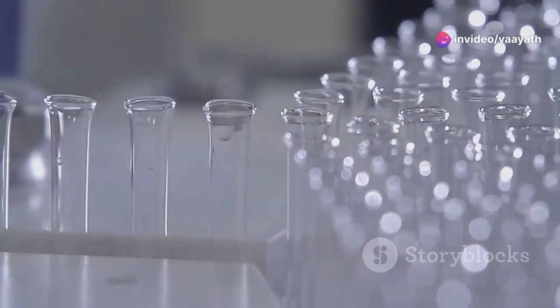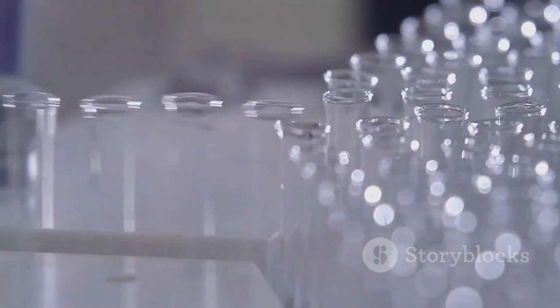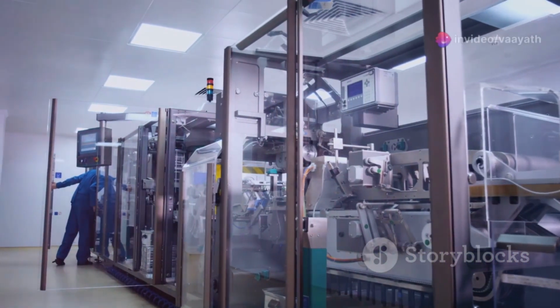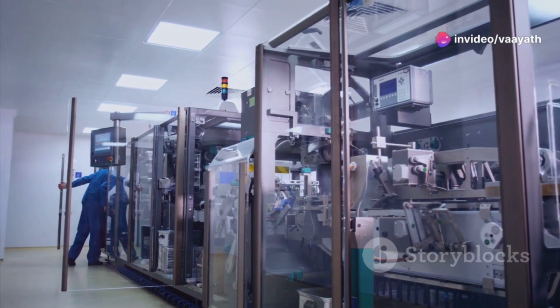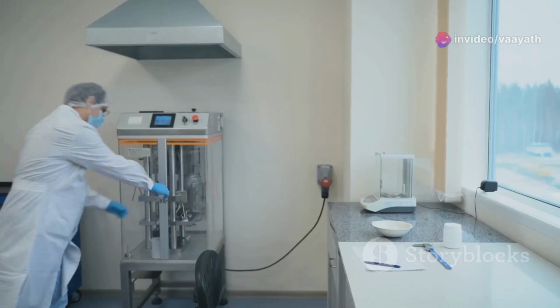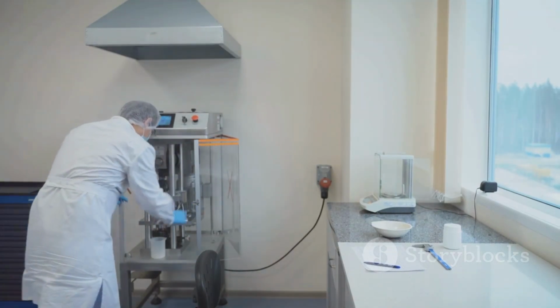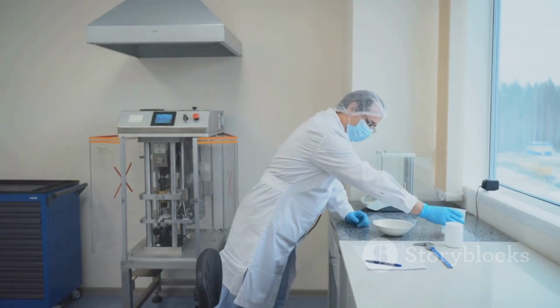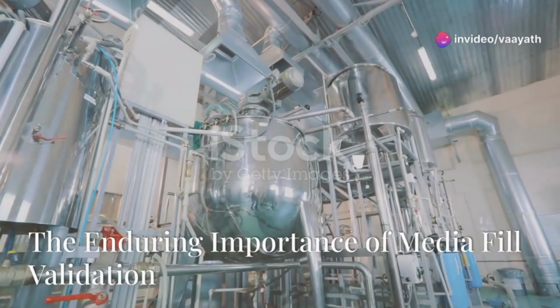On the other hand, failures in media fill can have significant consequences. One notable example is a case where a contaminated batch of intravenous drugs led to a widespread outbreak of infections, resulting in numerous hospitalizations and even fatalities. This tragic incident underscores the critical role of media fill validation in preventing such disasters and safeguarding patient safety.